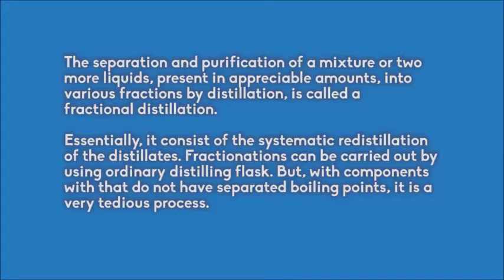The separation and purification of a mixture of two or more liquids present in appreciable amounts into various fractions by distillation is called fractional distillation. Essentially, it consists of the systematic redistillation of distillates. Fractionation can be carried out using ordinary distilling flasks, but with components that do not have separate boiling points, it is a very tedious process.